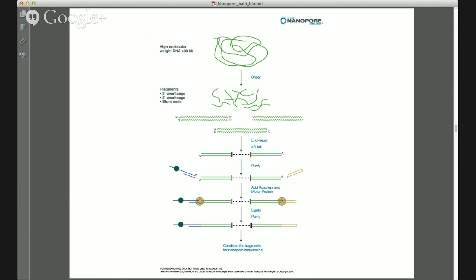Clive mentioned this already, but it is important that if you're going from genomic DNA, it does still need to be sheared. So ideally you want to start with very high molecular weight DNA, and you want to do the minimal amount of shearing to try and preserve long fragments. So we use the g-TUBE protocol, which is recommended, with a slightly reduced speed of 5,000 RPM, to encourage longer fragments in the mixture. And it is quite important when you're doing the sample preparation to take care when pipetting, trying to use wide bore pipette tips, and trying to disrupt the sample as little as possible, so that the long fragments persist through in the mixture, because they are quite fragile when you're talking about very long reads.